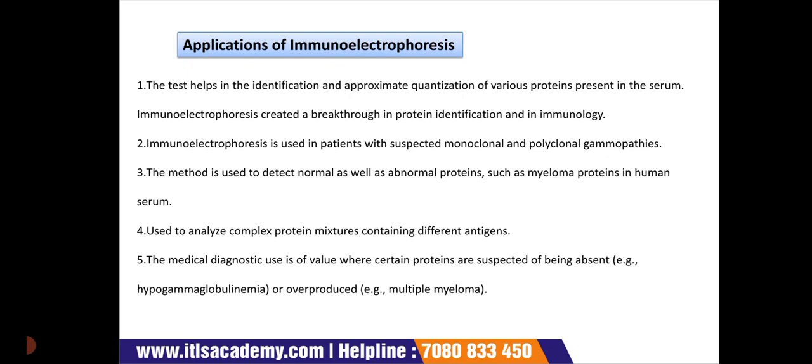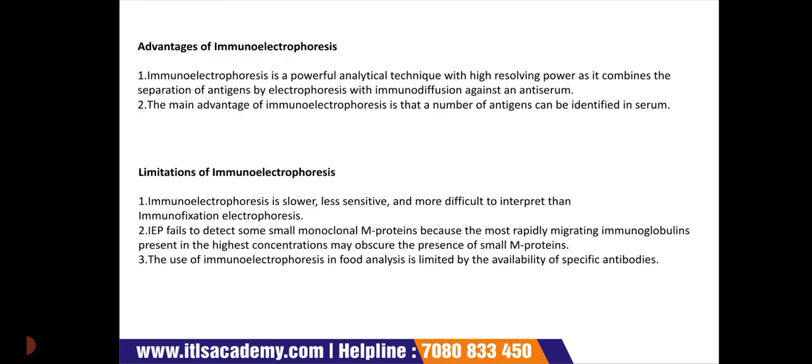Then at last we discussed the advantages and limitations, what are the advantages of using immunoelectrophoresis and what are the limitations. So these are all things that you should always keep in mind while you are revising this lecture.